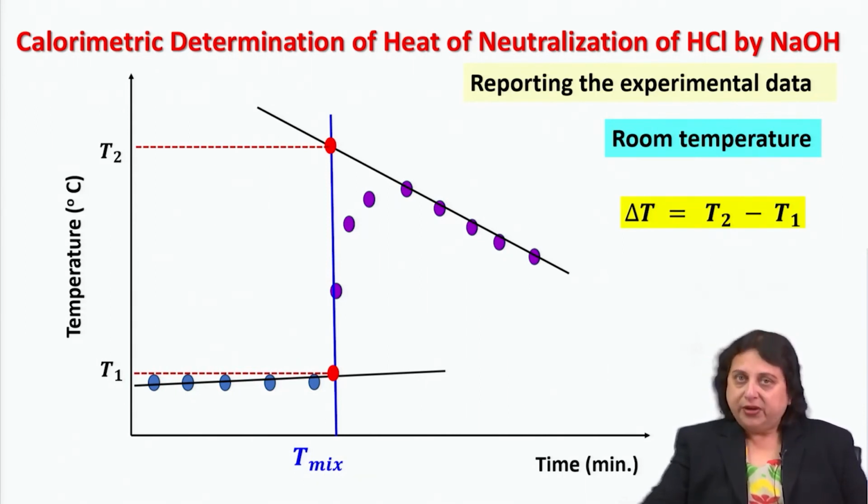Okay? So, after you have finished mixing, you have closed the lid. Now, this kind of fast irreversible heat flow will be arrested. Why is that so? That is because the material with which the calorimeter has been prepared is a poor conductor of heat. With the calorimeter now being a closed system, the heat will slowly seep out from inside the calorimeter to outside. Why should it still seep out?